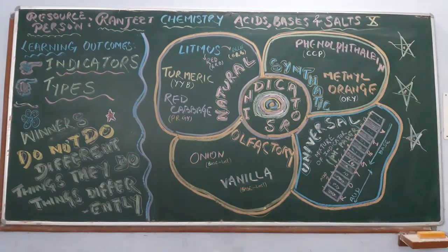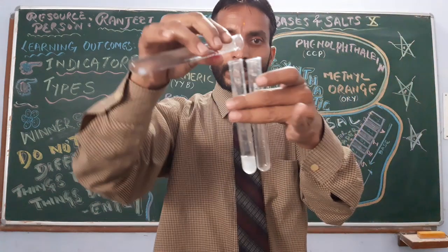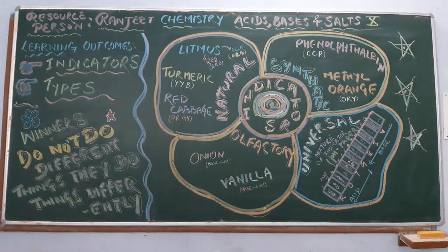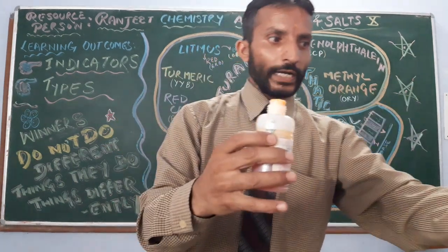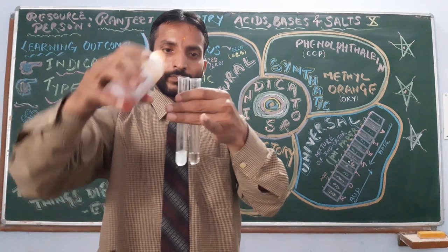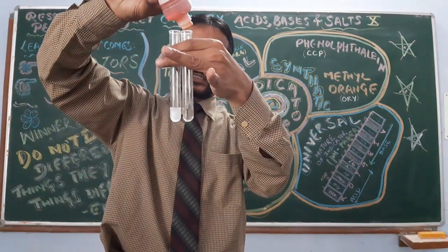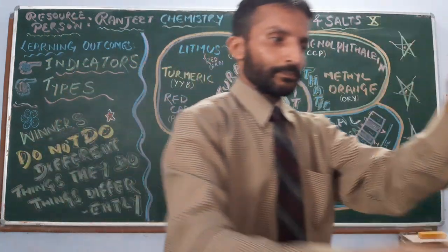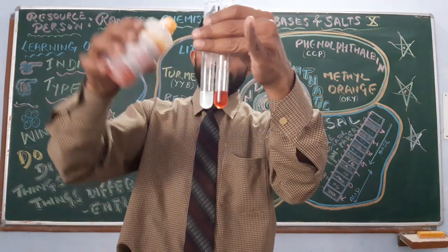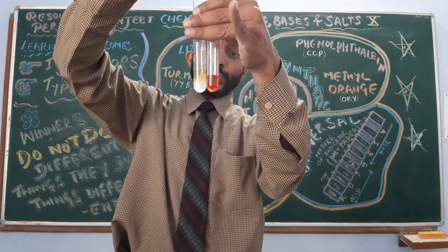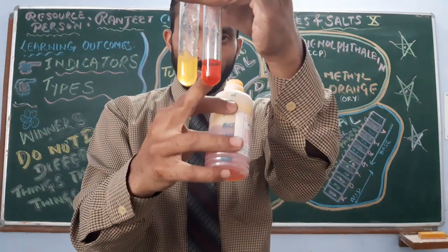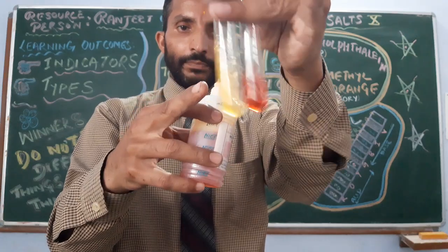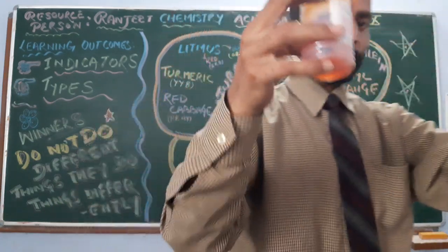Let us see practically. Again, acid and base — this is base, this is your acid. Now methyl orange — in acid it is red-orange. But in base it becomes yellow. So: in acid — red-orange; in base — yellow. This is about methyl orange.